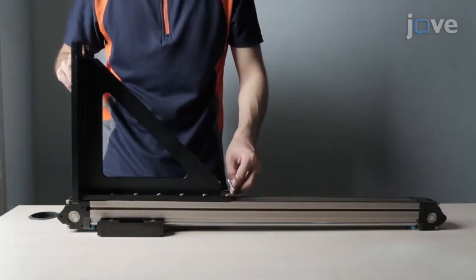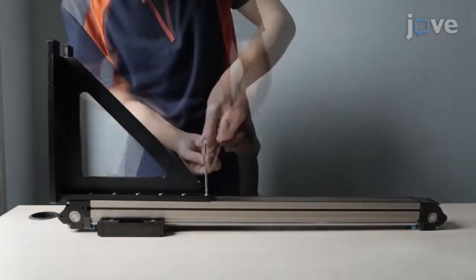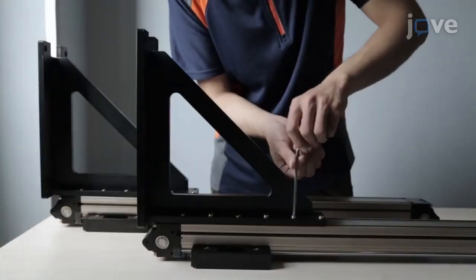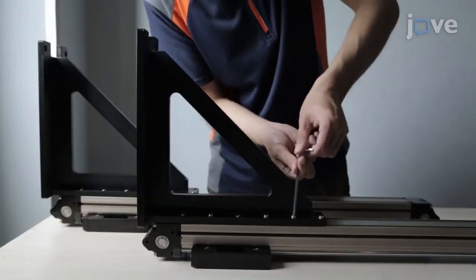Pull the triangle frame to the end that is distal to the shaft and tighten the screws. Attach the other right triangle frame to the other Z-rail in the same way.